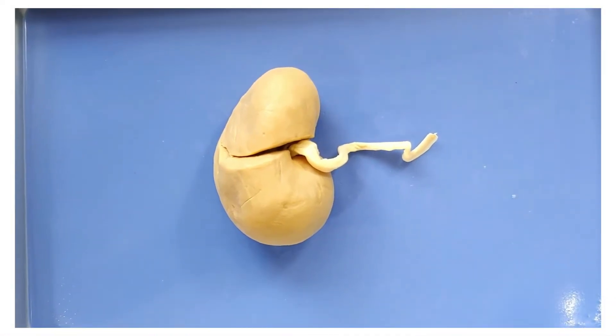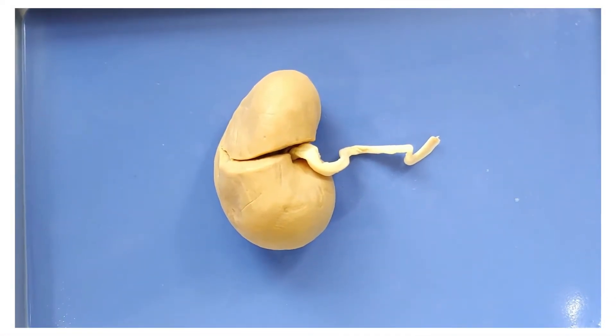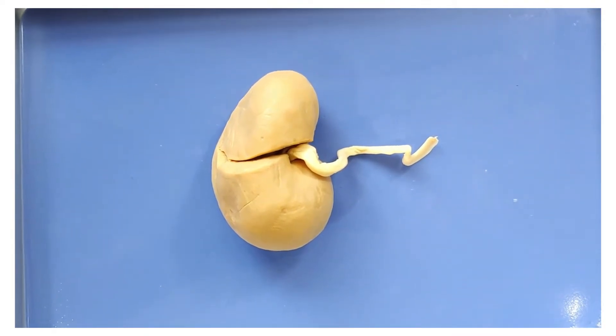Hello and welcome to O-Wyrm. Today we'll be doing something a little different. We'll be doing an organ dissection — more specifically, the kidney.